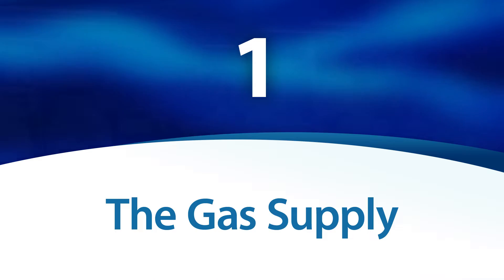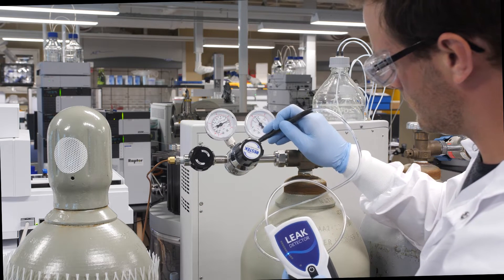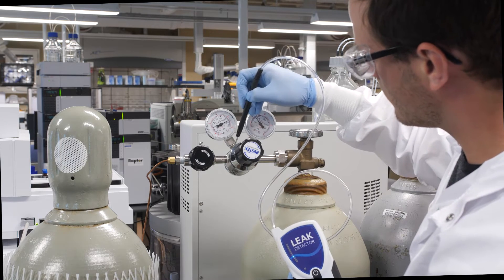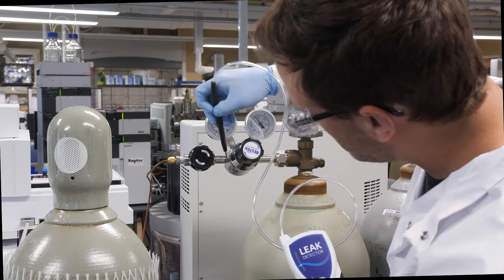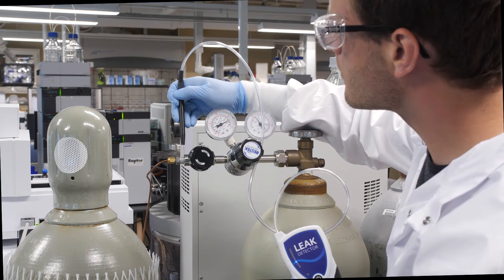Now that we're ready, let's hunt down those leaks. The gas supply. Sometimes the leak isn't immediately near your GC. Always check your cylinders, generators, and manifolds. Each of these should be the first place you check when you suspect a leak. Pay special attention after installing new gas cylinders, particularly around the regulator.